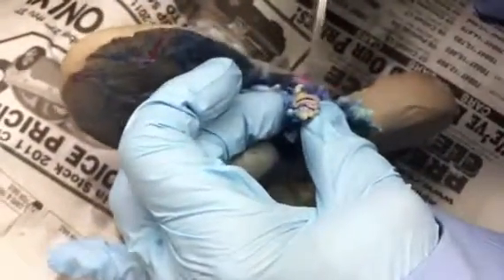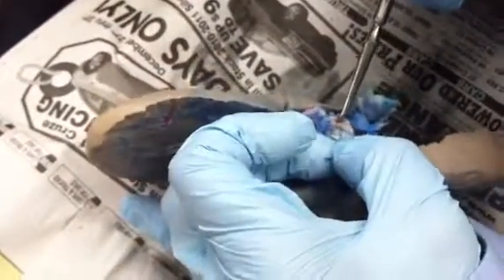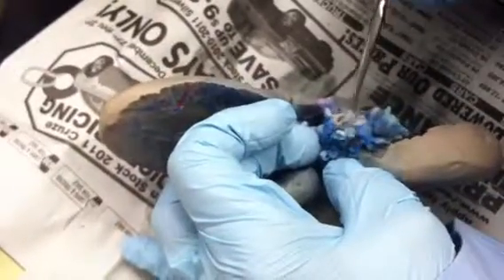Okay, so the first thing we're going to look for is the blood vessels and the ureter. Now this one doesn't have a really good ureter. It does have nice blood vessels. This is an artery, and that could be the ureter, but it's awfully stretched out, but that's probably the ureter. You should see the ureter covered with fat. There should be a very fatty tissue around it.